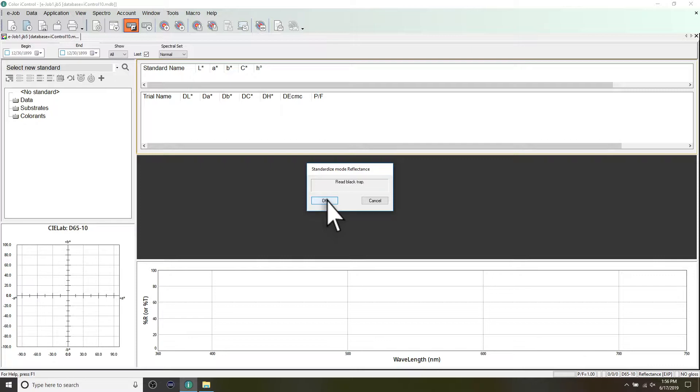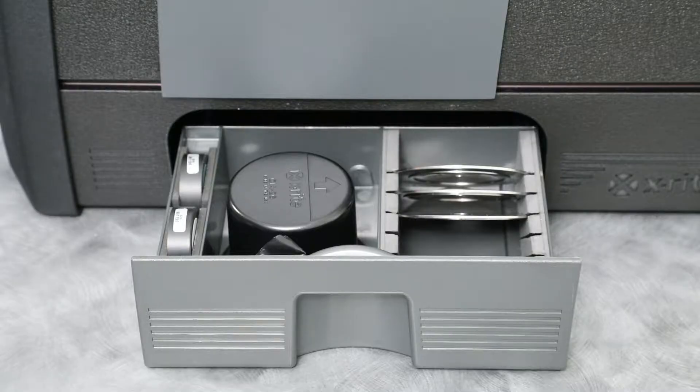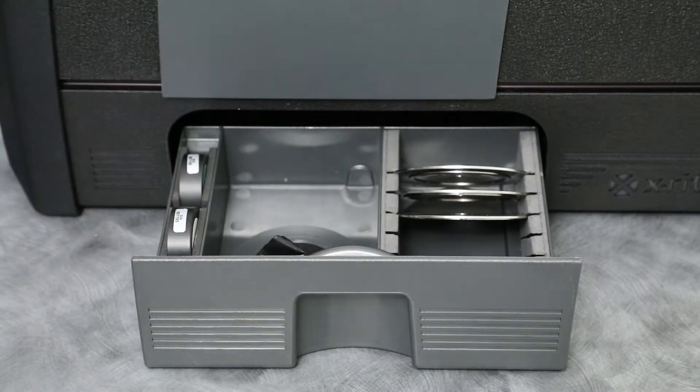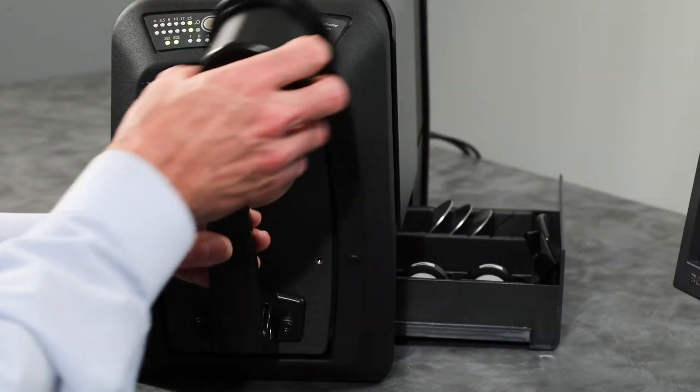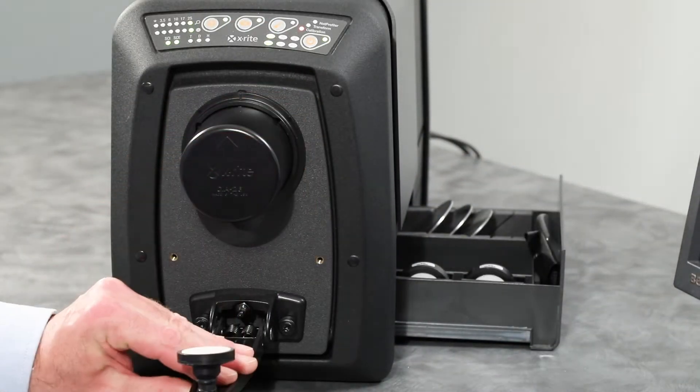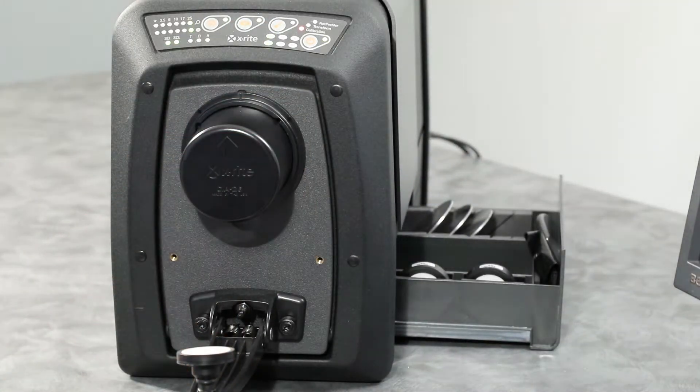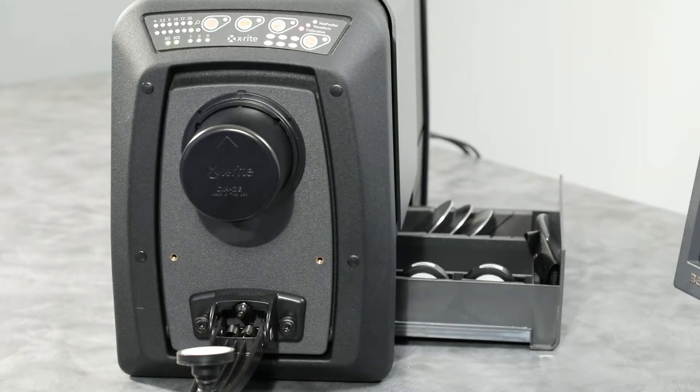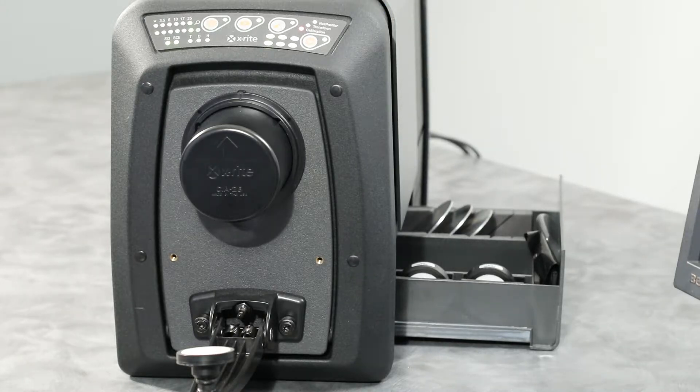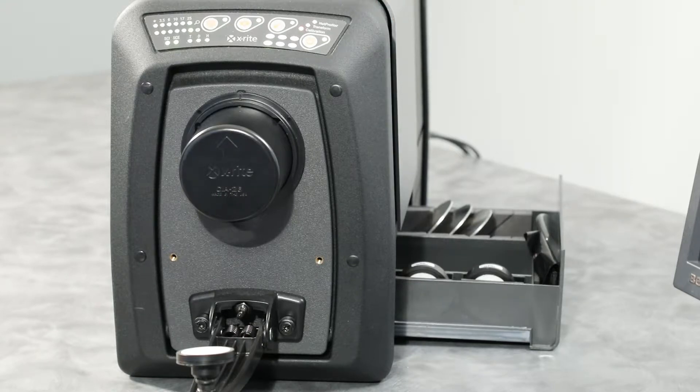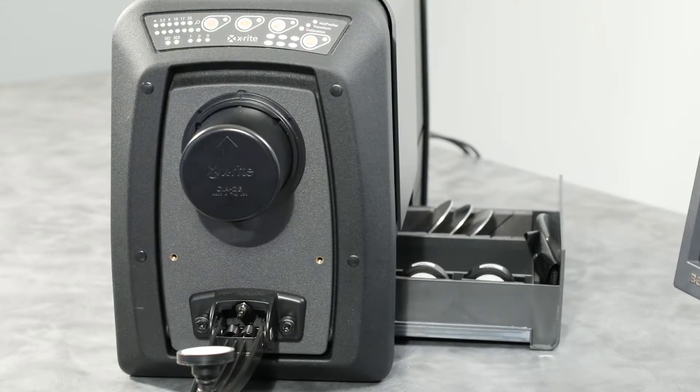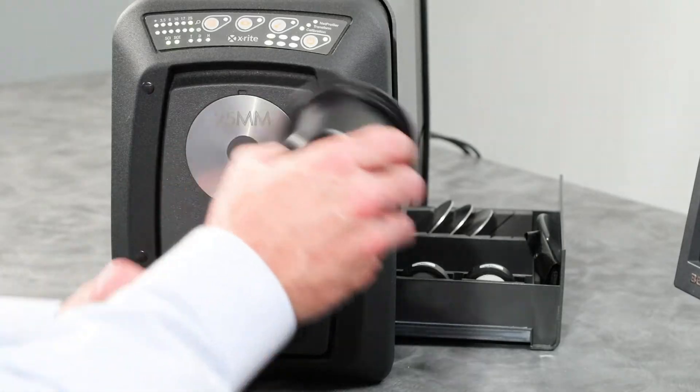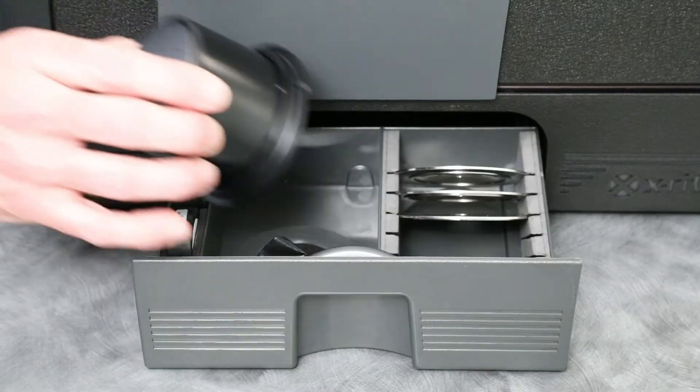Next, you will be asked for a black trap measurement. Remove the black trap from your accessory drawer and position it on the aperture plate so that the tab on the top edge of the black trap aligns with the notch at the top of the plate. Initiate the measurement from your software. After the measurement is complete, return the black trap to your accessory drawer.